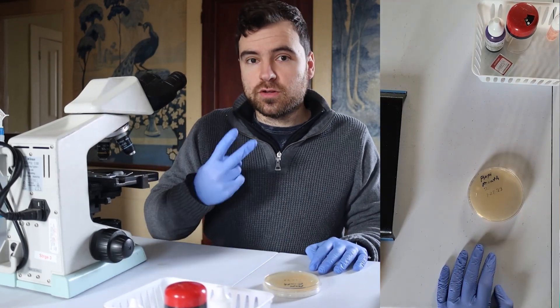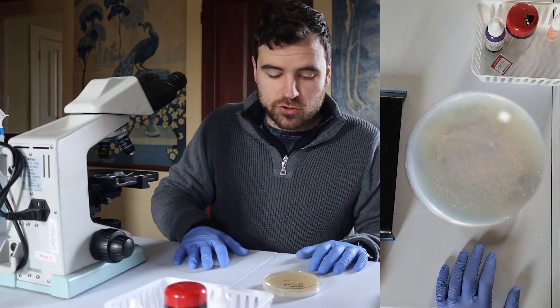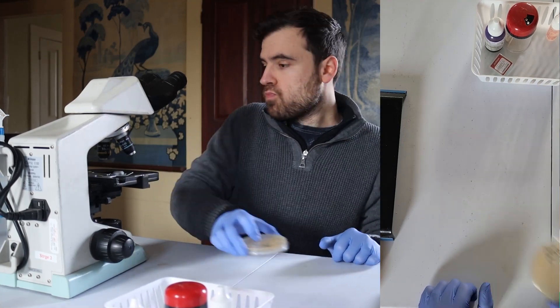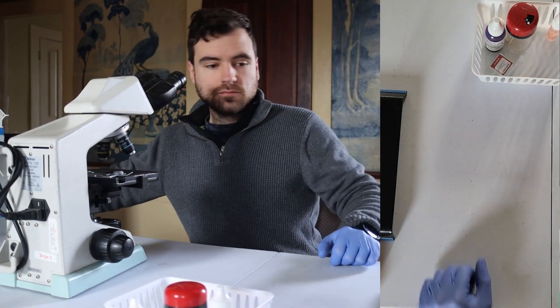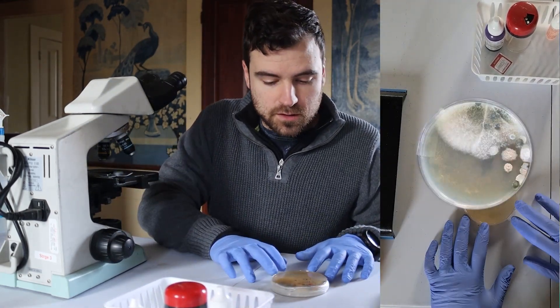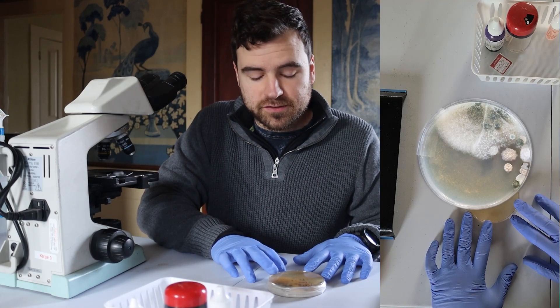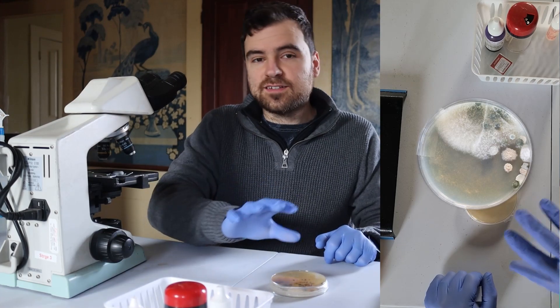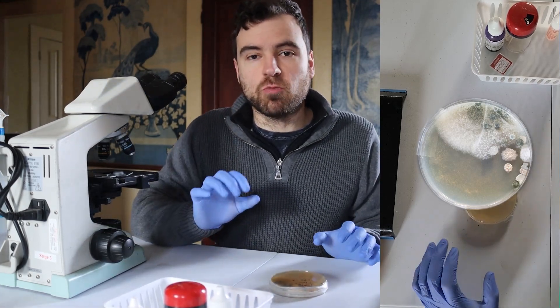Here's our P.O.P. Ni mouth 2 — the diluted version — and as you can see there is one colony there. Now this is the floor plate, and this is what is disgusting. Floors are dirty, my friends.